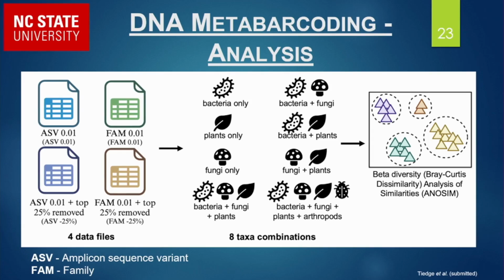How do we use it to do these comparisons? I'm going to walk you through this slide. The first thing I want to highlight is that very left panel. We essentially get varying levels of granularity with this data. We can get down to the very sequence, which is what we have here, the ASV. So this is the very sequence. How many of that sequence do we have, and what is its taxonomic identity?